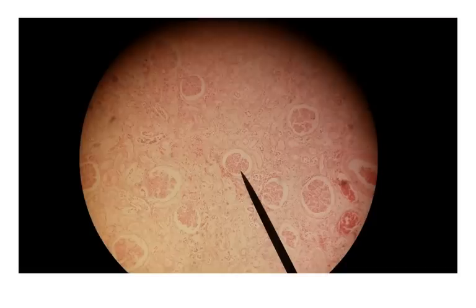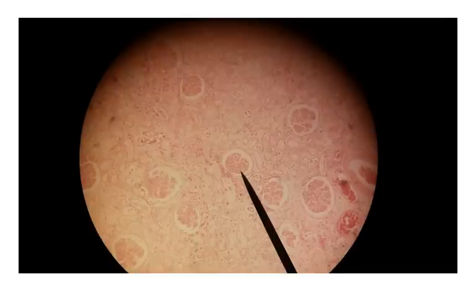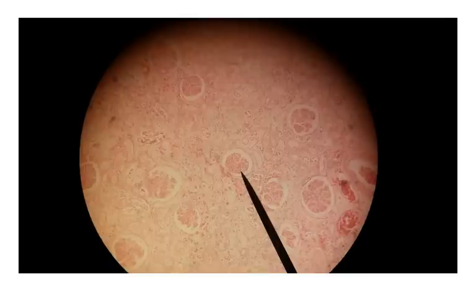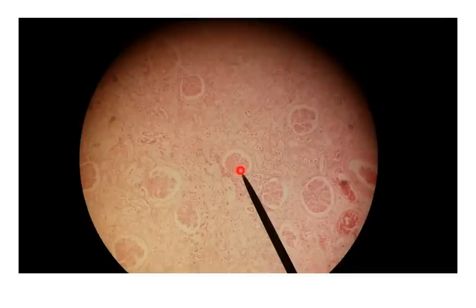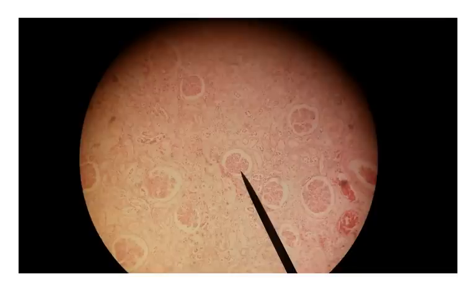Now we're moving to the renal system — looking at the kidneys. A lot of what we see in the background are small circles or ovals called kidney tubules. Most of the nephron you'll study in lecture is composed of tubules, and these are made mostly of simple cuboidal epithelium. The big prominent feature here — right at the tip of the pointer in the middle — is a special type of capillary called a glomerulus, where all the blood being filtered passes through and filtration takes place.